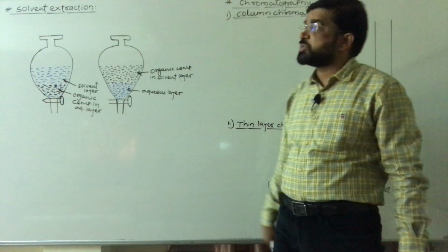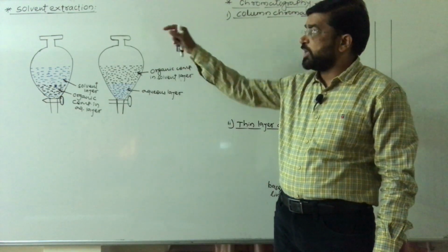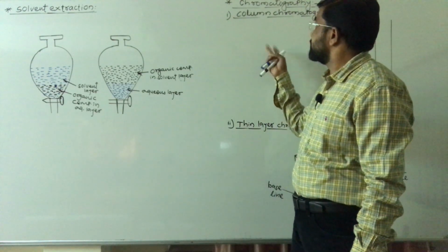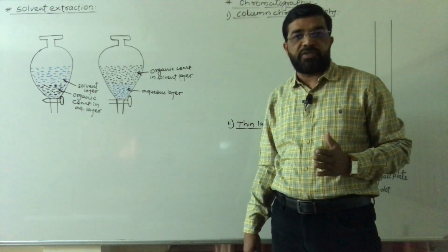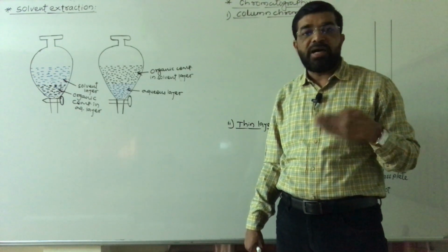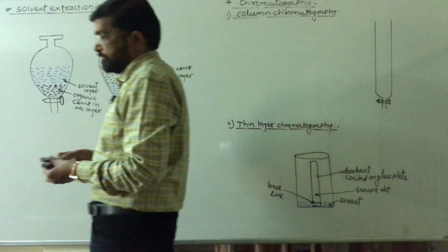Today we are going to study some more processes of extraction. First of all we will study solvent extraction, and later we will study the chromatographic technique. In chromatography there are two types: adsorption chromatography and partition chromatography. So here, see solvent extraction.